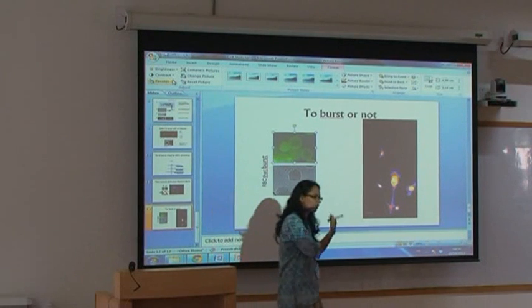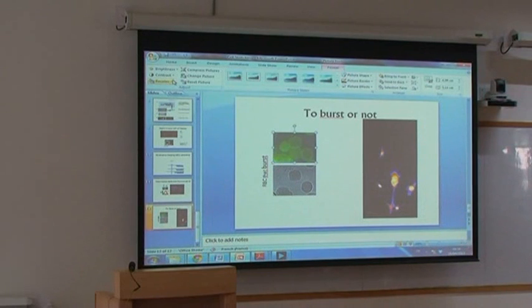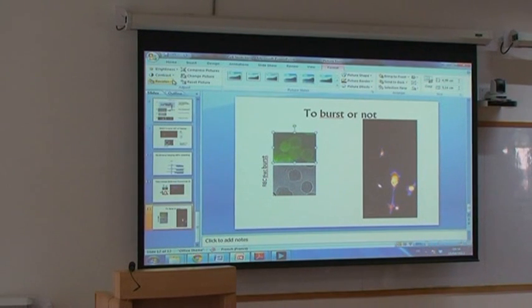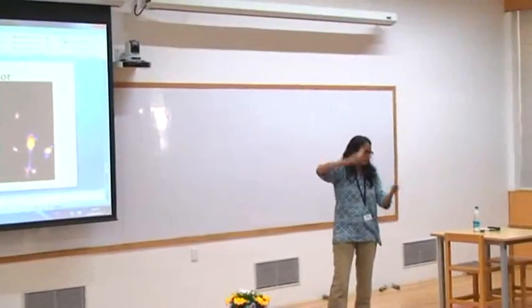We could not follow the cells while we were stretching, but we could see a lot of rupturing events in the whole sample. With eukaryotic cells, this was one of the rare movies where we saw a rupturing event, and that too, these are myotubes from patients who have muscular dystrophy. Otherwise, eukaryotic cells can take a huge amount of stretching. You could see that.